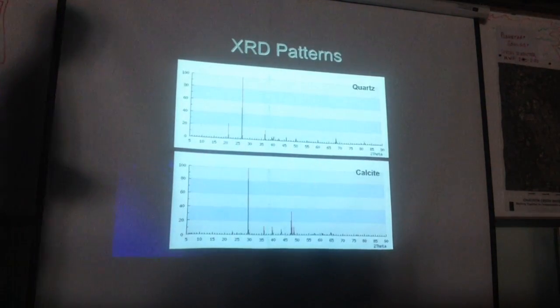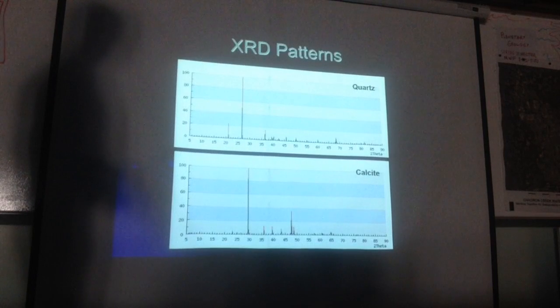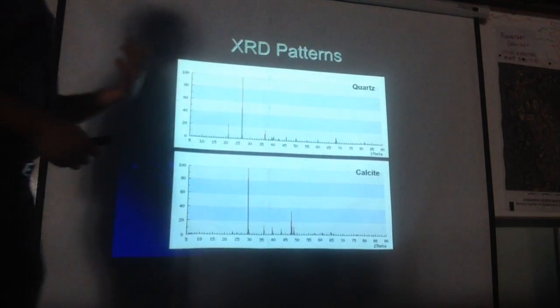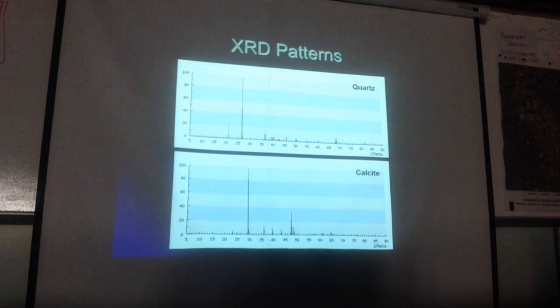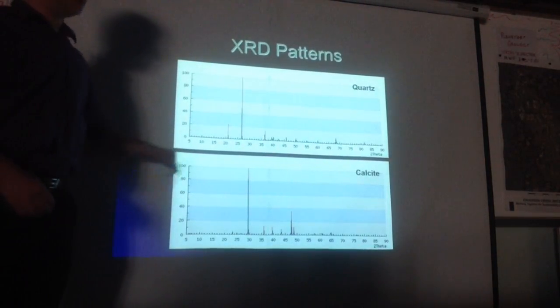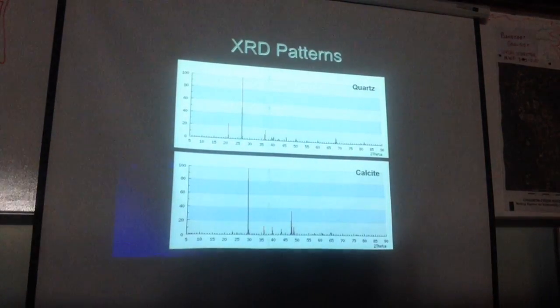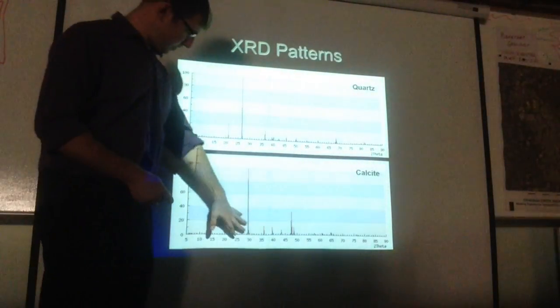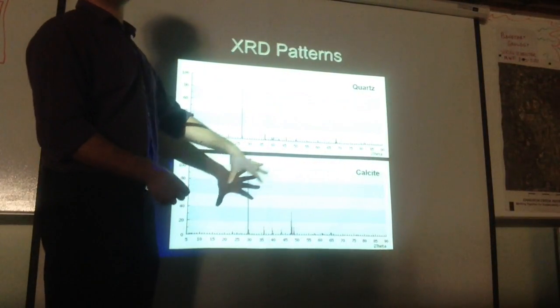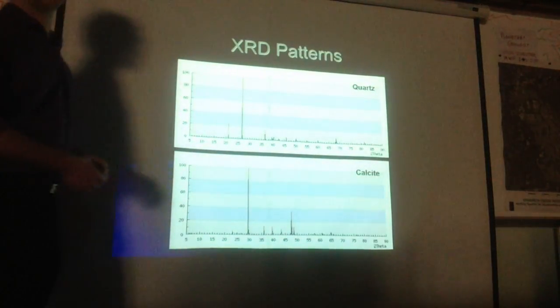Well, what's the vertical axis? The vertical axis is CPS, which is counts per second, which is not necessarily arbitrary, but it basically is the intensity of your peak, and basically represents the percentage to which your peak was detected in the sample versus everything else.